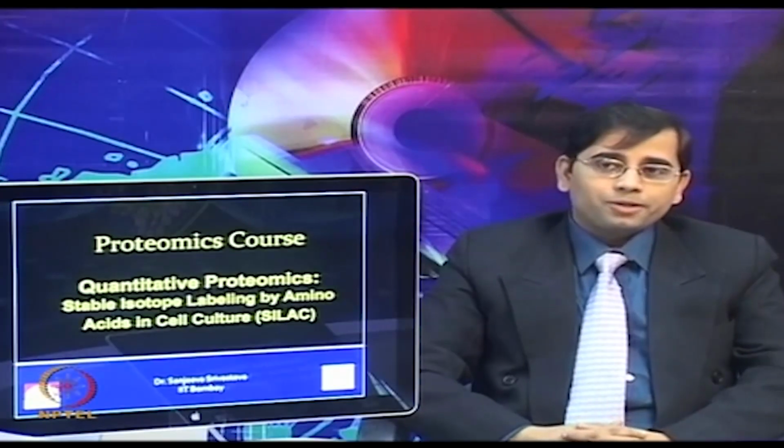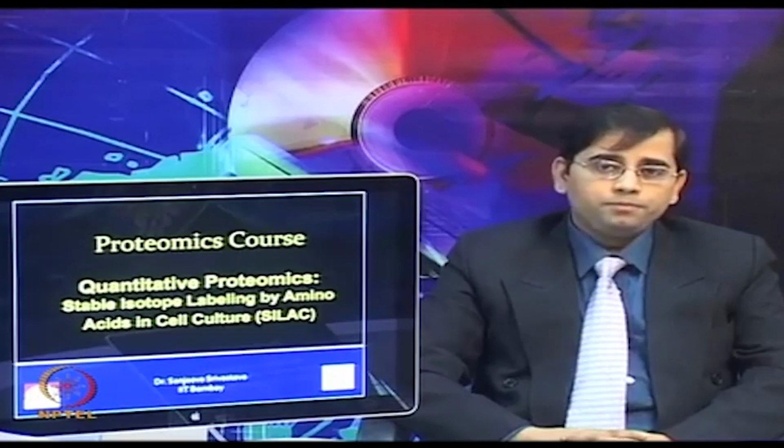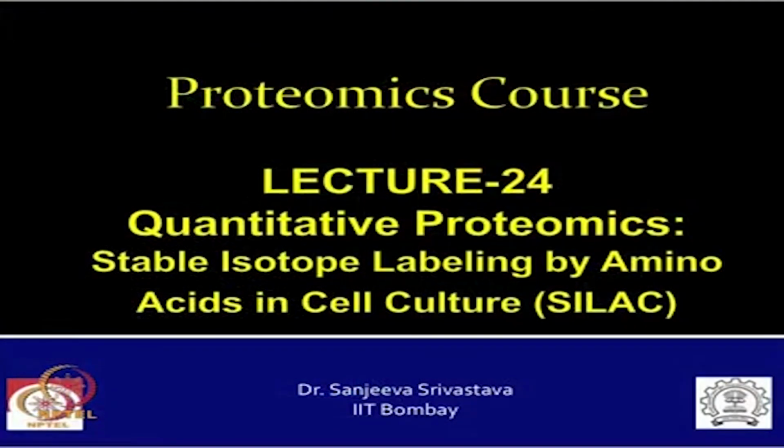Welcome to the Proteomics course. In today's lecture, we will talk about quantitative proteomics, the stable isotope labeling by amino acids in cell culture, SILAC.